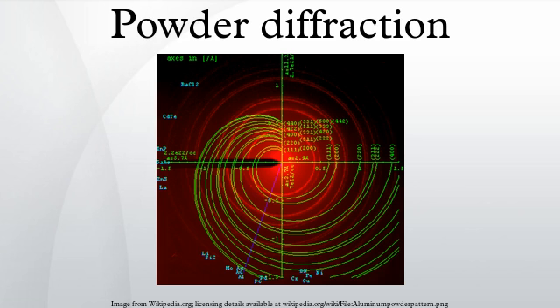The result is that the crystallinity will never reach 100%. Powder XRD can be used to determine the crystallinity by comparing the integrated intensity of the background pattern to that of the sharp peaks. Values obtained from powder XRD are typically comparable but not quite identical to those obtained from other methods such as DSC.